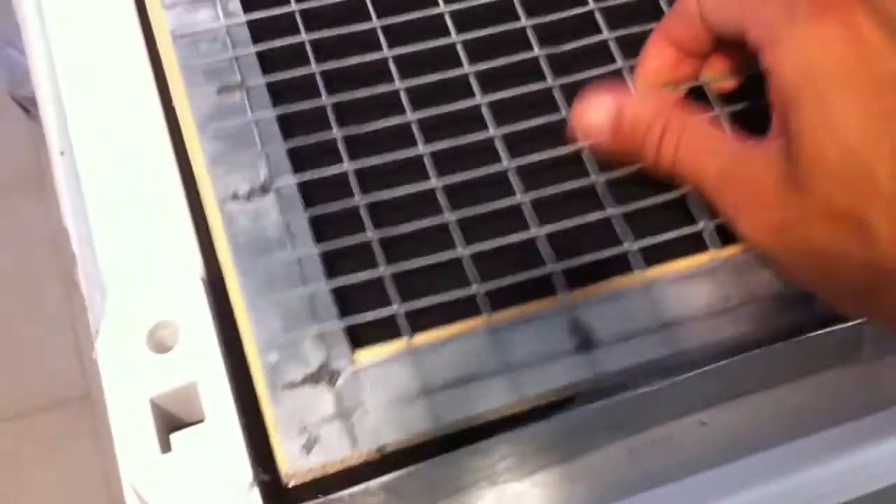The initial design did not include the polyfill filter — that's something we added. We have this polyfill filter folded in, and here we have a grid that I glued to a wooden frame.